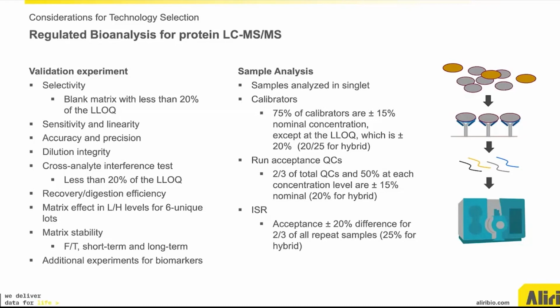utilized. As with all method validations and sample analysis, the experiments and acceptance criteria should be predefined and documented in an SOP or method validation protocol, and regardless of the methodology used, it is essential to employ well-characterized, fully validated bioanalytical methods to ensure reliable results. This will allow for critical go, no-go decisions along the drug development pathway.